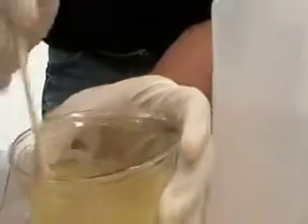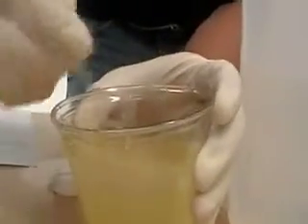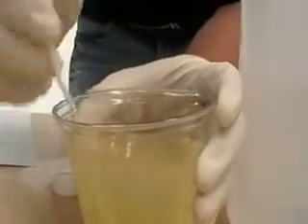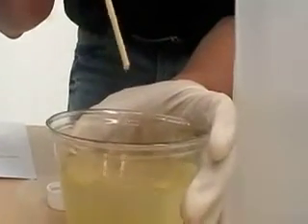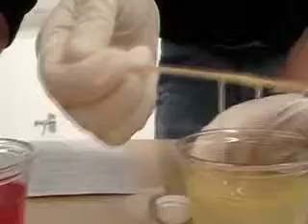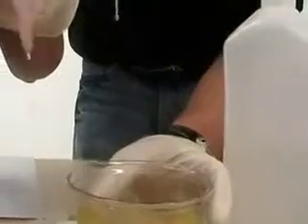And so you can see a little bit of DNA here with Ron's peaches. And what might be fun to do with the students is ask them to make some observations throughout the experiment and as to why I have more DNA in my strawberry than Ron sees with the peaches.